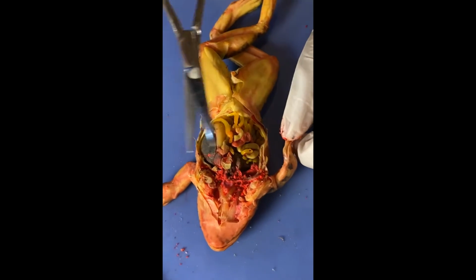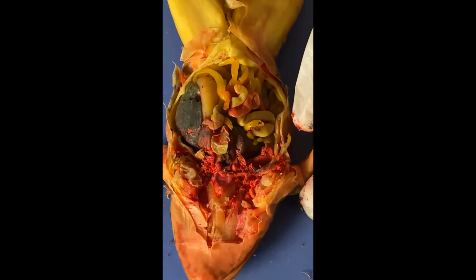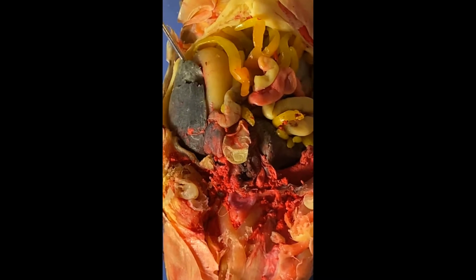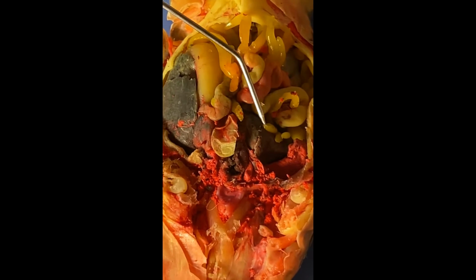As you can see, I cleaned up the frog and cleaned up the skin, and here are all of the internal organs. The first thing you're going to notice is the liver. So the liver has 3 lobes. This is 1 lobe, 2 lobe, and the 3rd lobe is in the back over here, covered by the rest of the organs.